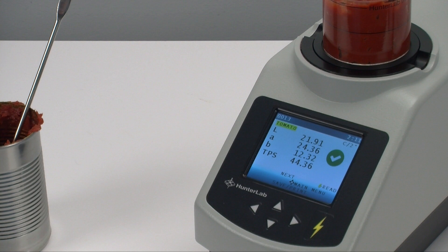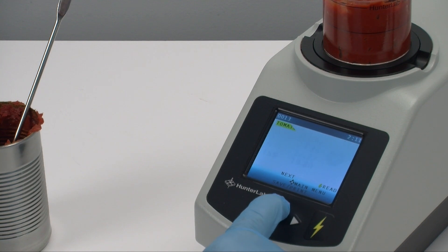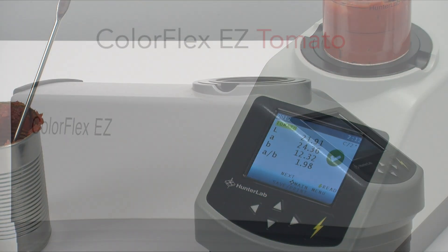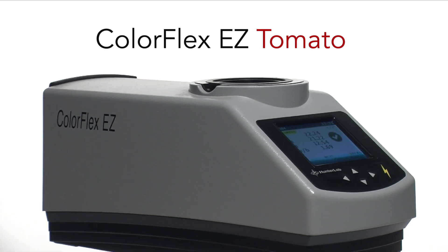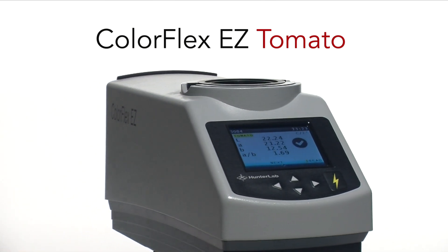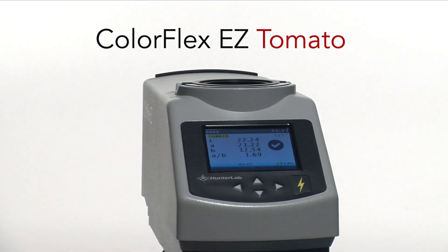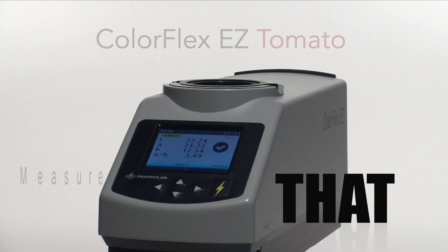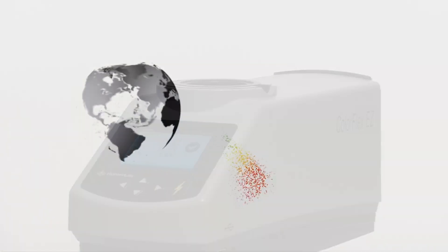Finally, as all the different tomato scores are embedded in the tomato product setup, you only have to use the directional up arrow to change the view to other tomato indices. The ColorFlex Easy Tomato gives you the most efficient process for measuring the color of tomato paste in the industry. Pour. Place. Measure. It's that easy — and only from Hunter Lab.